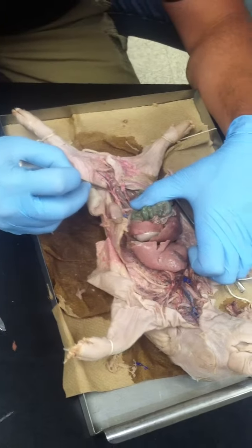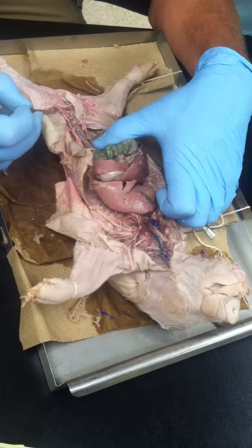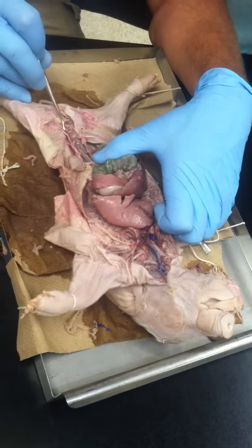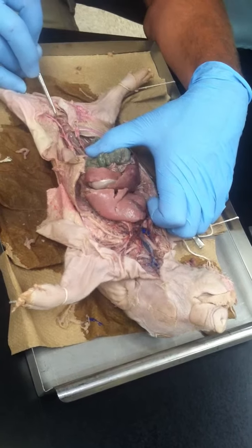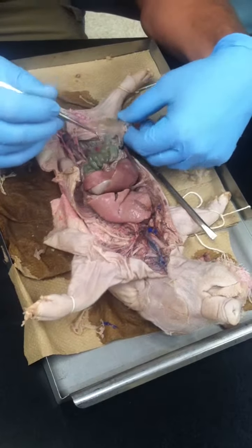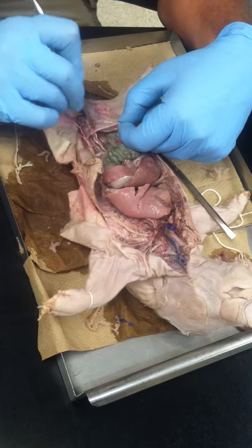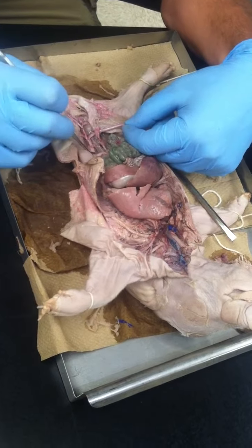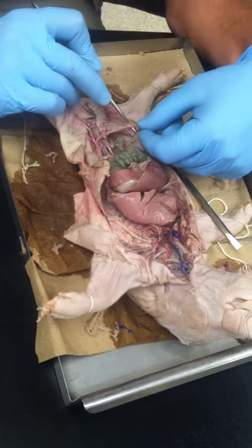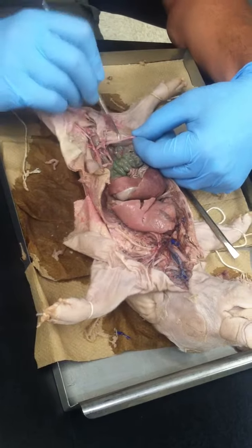Now you continue down iliac. Iliac will eventually lead to that femoral. So femoral I'll pin way down here. And then there's your femoral vein. That's kind of deflated. And umbilical artery. We'll label that right here. Follow that aorta coming down to your umbilical artery. And that's it for the vessels.